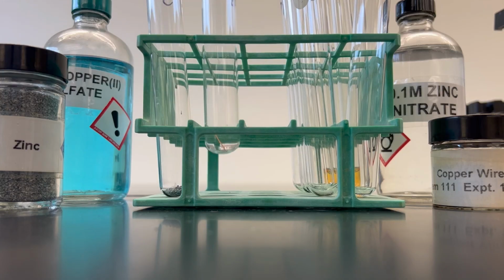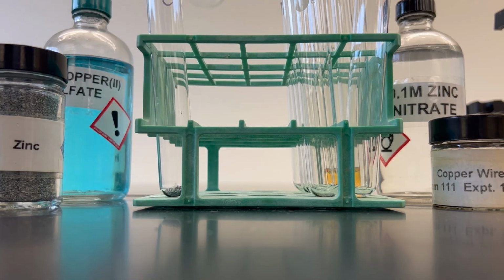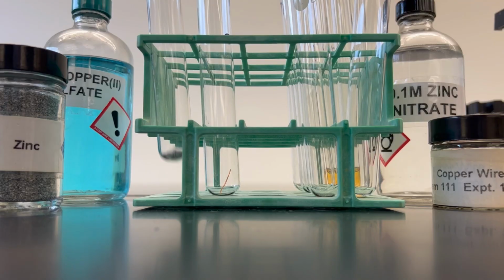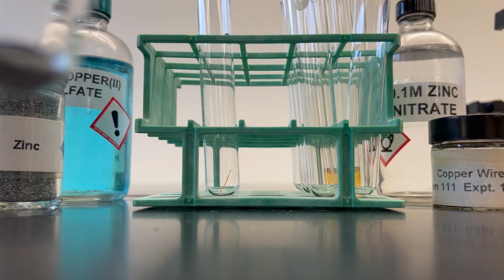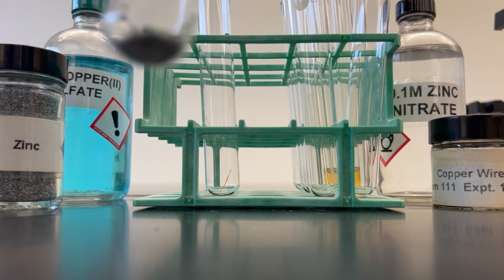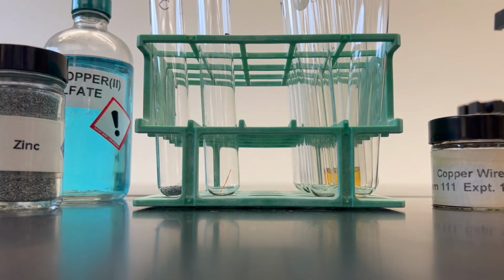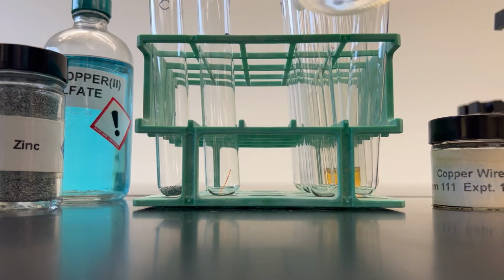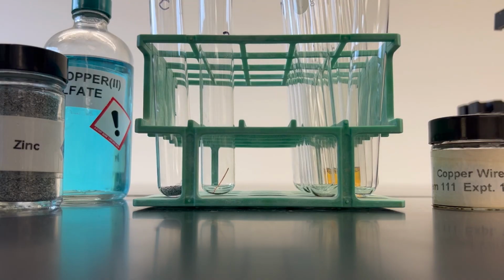Okay, in this test tube I have a piece of solid copper wire. And in this one I have some little pieces of zinc. Now, into the test tube with copper wire, I'm going to add a small amount of zinc nitrate.